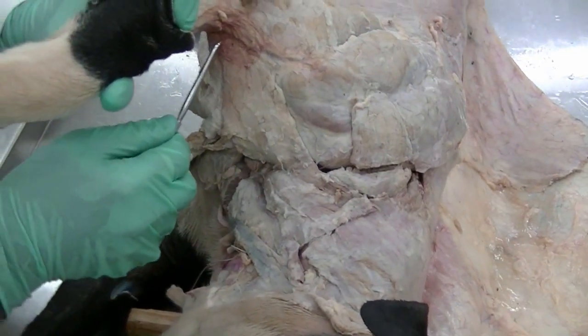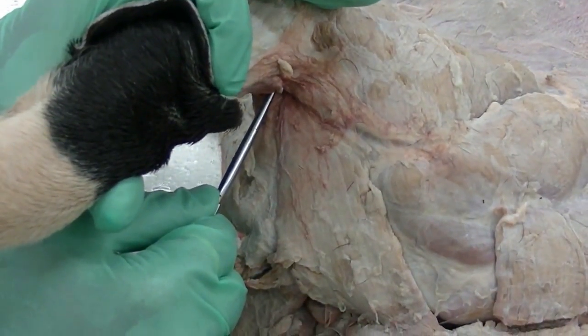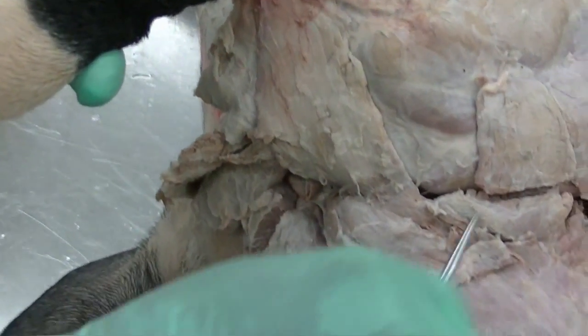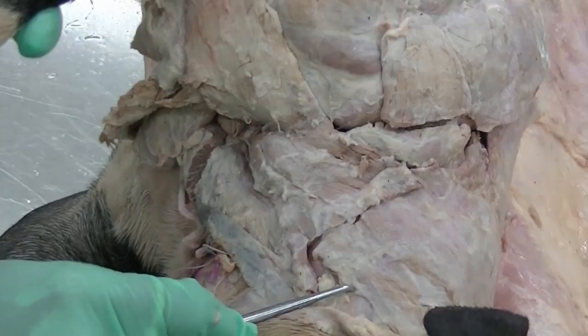The muscle at its attachment towards the arm, or brachium, is much narrower or tapering, while towards its attachment on the neck as well as on the head, the muscle becomes much more widespread.